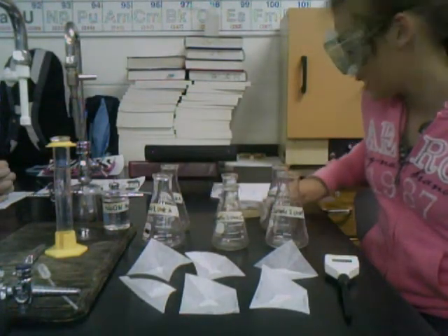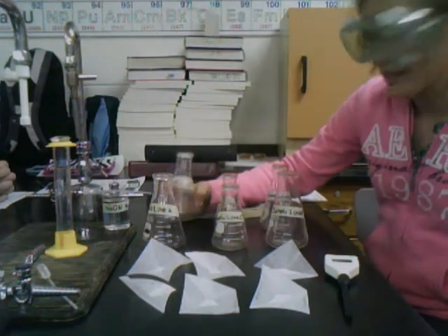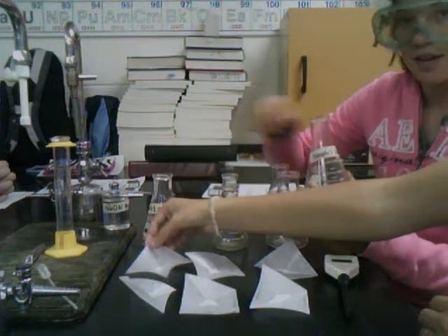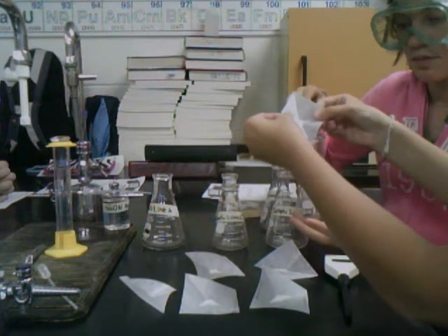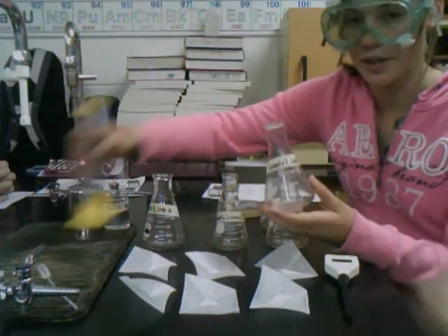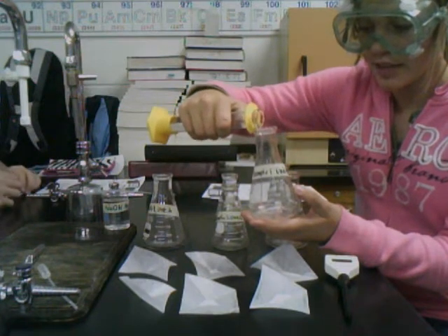We're going to be determining the Ka value of weak acids in this lab today. We're going to start by putting our unknown sample A into the beaker. We're going to dissolve this in 50 milliliters of distilled water and add some phenolphthalein so we can begin titrating.